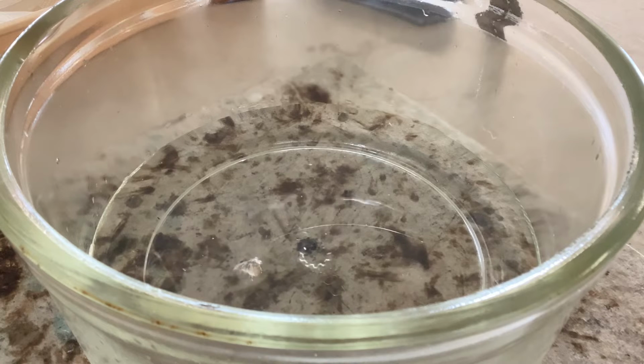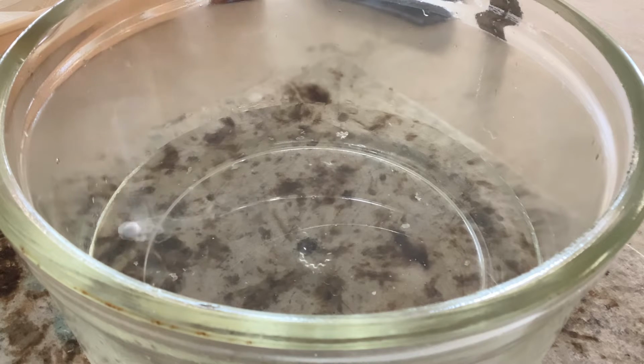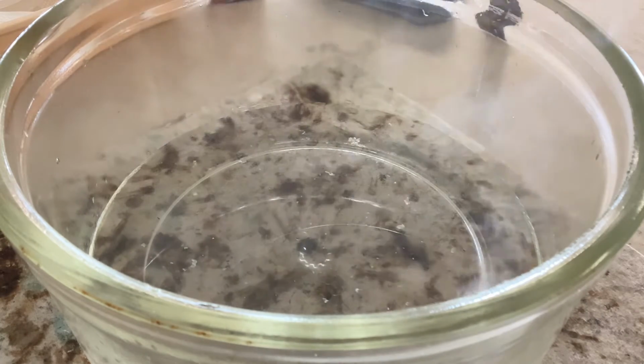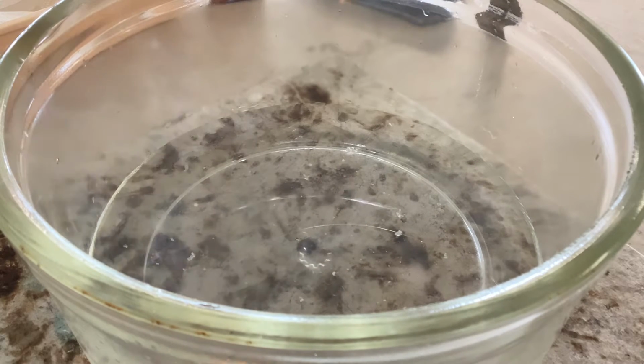There is some bubbling, and then it turns into a silvery ball, maybe with some white smoke, and you may hear some hissing sound. And also you can see some golden yellow fire on top.